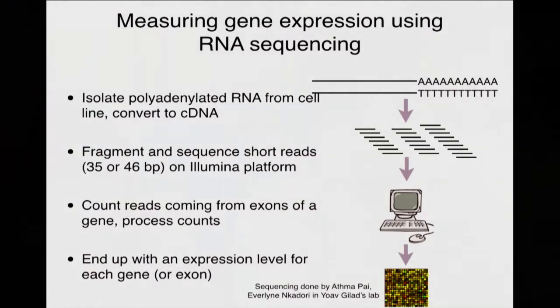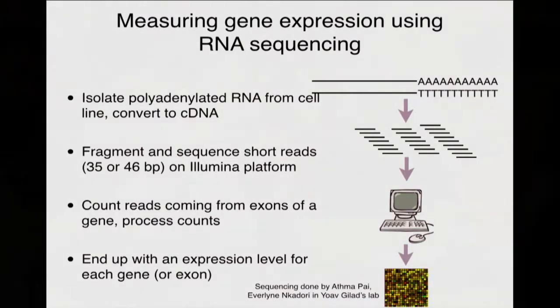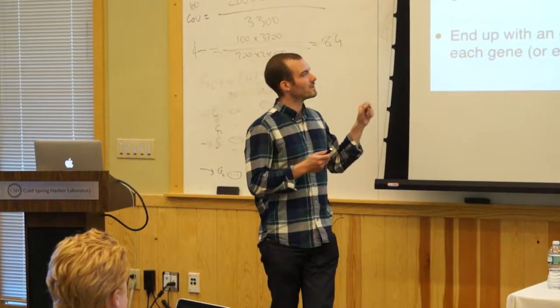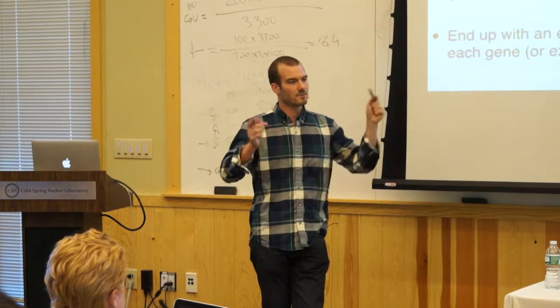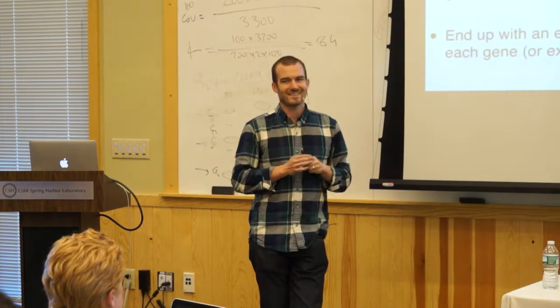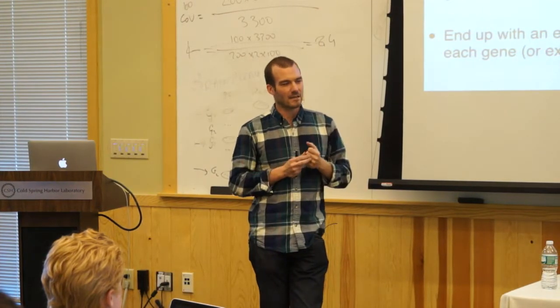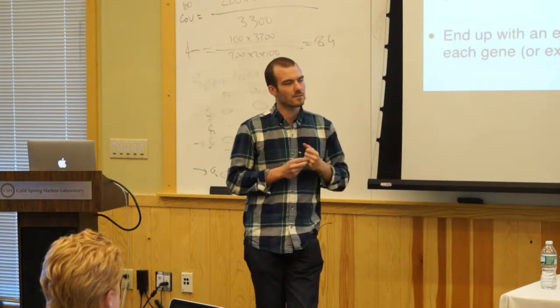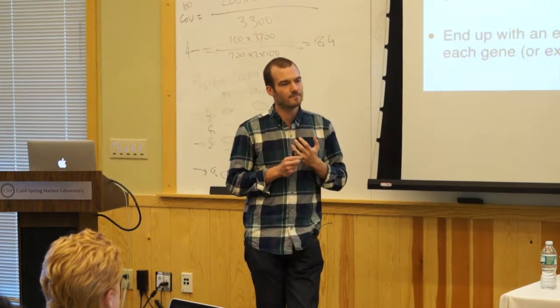Right. That was just to isolate the RNA, and then it was random primers. Yeah, so there we looked at some point for biases towards one end or the other, and if there was anything, it was very slight. So the random primers do tend to get a pretty good coverage of the gene.